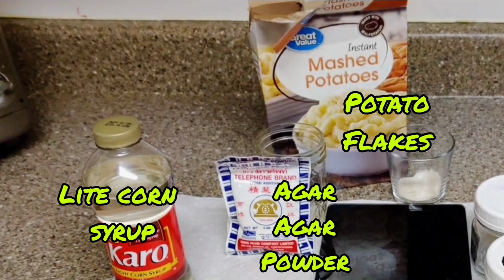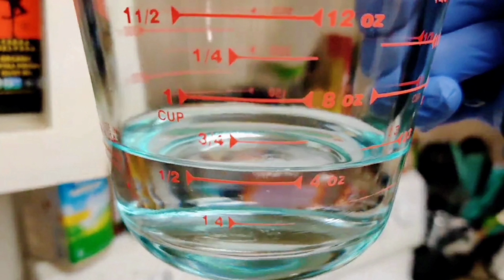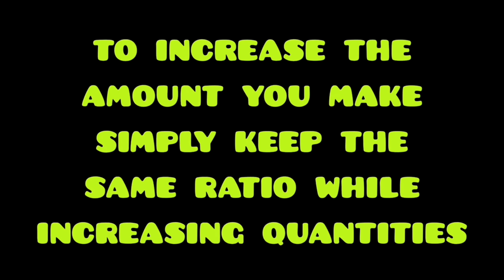The ingredients I'm going to use include potato flakes, commonly known as instant mashed potatoes, agar powder, light corn syrup, and I'll use a half a cup of sterile water. The ratio I follow is 3-2-1: 3 grams flakes, 2 grams agar powder, 1 gram corn syrup. To increase the amount, simply keep the ratio the same while increasing quantities.